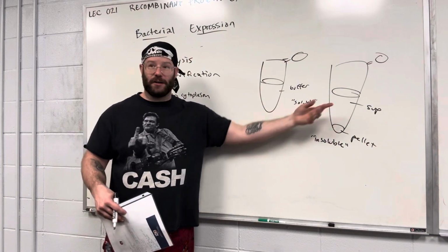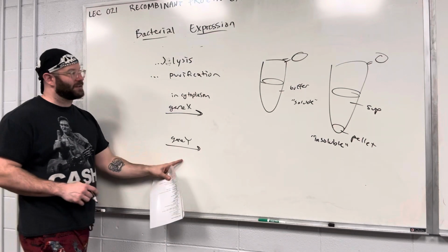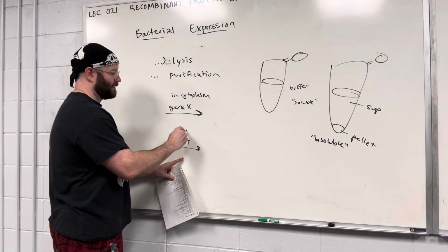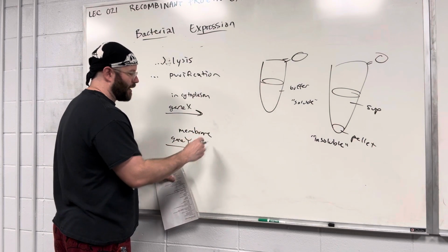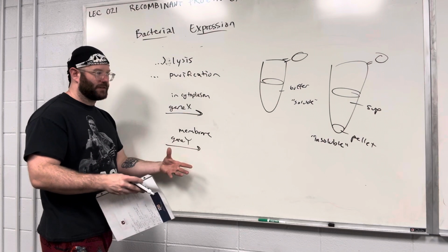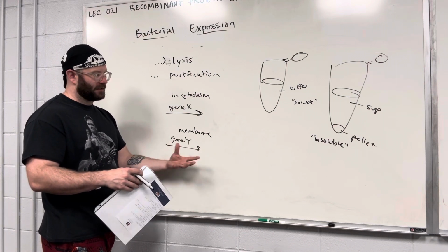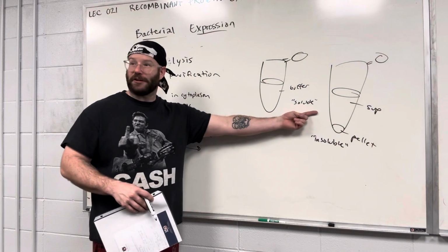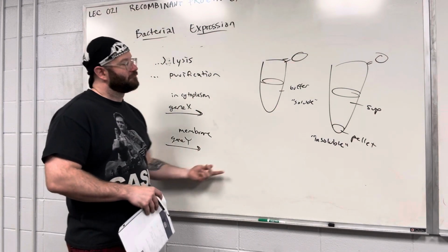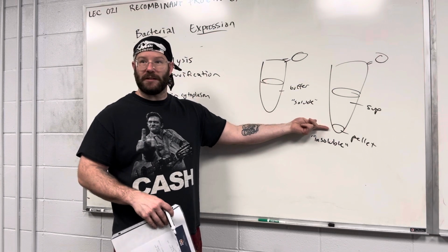Most proteins are soluble, okay? There are many other proteins that are insoluble, for example, membrane proteins. Membrane proteins have evolved to be comfortable in lipids, and lipids are not soluble in water. So if you're trying to purify a membrane protein, your protein would probably be mostly in the pellet.